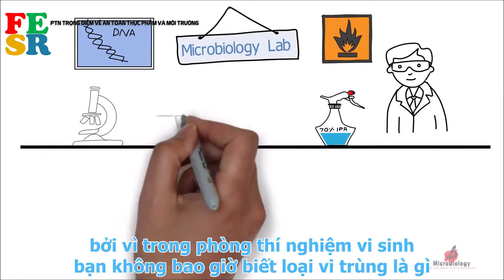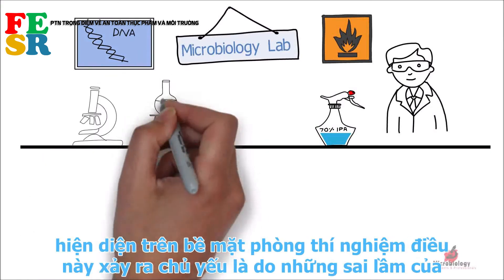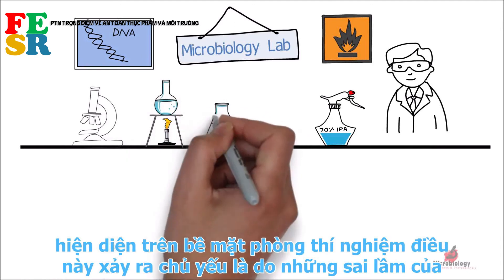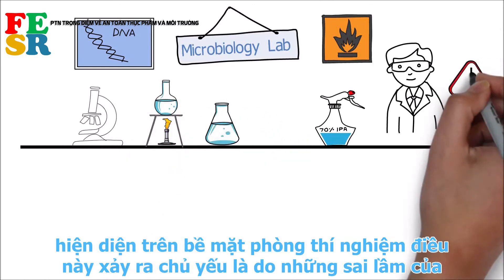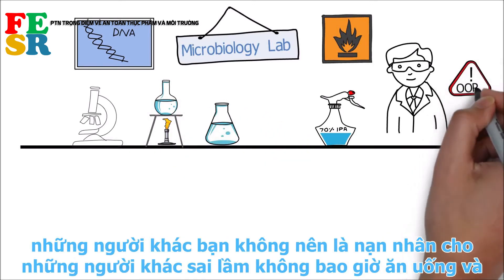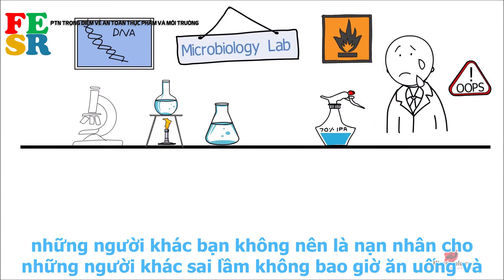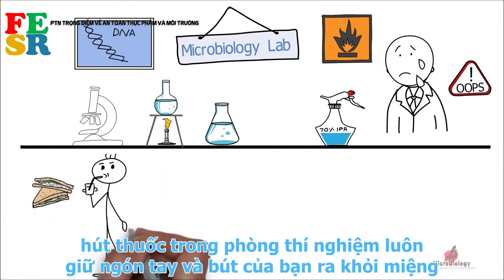Disinfect your hands with 70% IPA quite often, because in the microbiology lab you never know what kind of germs are present on lab surfaces. This happens mainly because of mistakes done by others — you should not be the victim of others' mistakes.